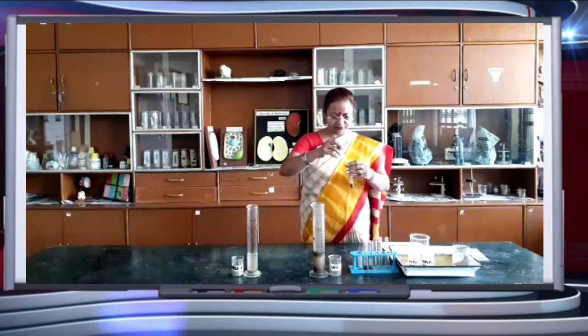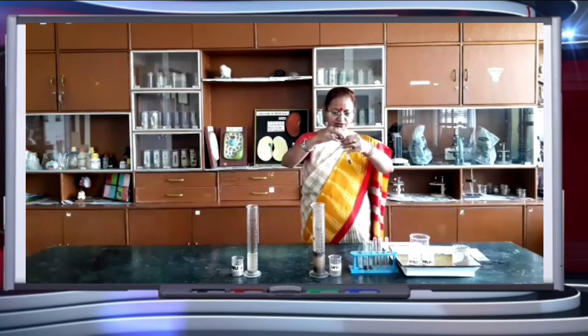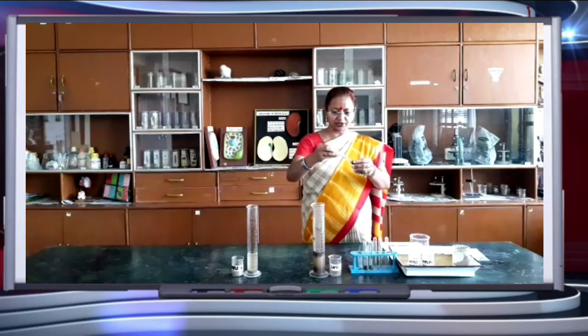Sample 1. Let's see, is there any change in color of pH paper?